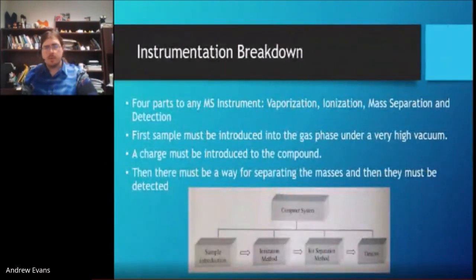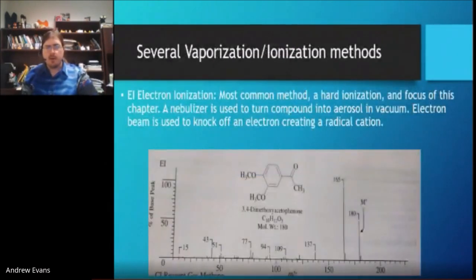As a quick note, the main way we ionize them is electron impact. Essentially, we have an electron gun, and when we have a molecule in the gas phase, it gets hit, and you're going to get various peaks. Say the molecular ion peak, which is the M plus peak, we're going to get maybe the maximum intensity peak, which is the most stable fragment, and various other fragments caused from loss of various pieces of this.